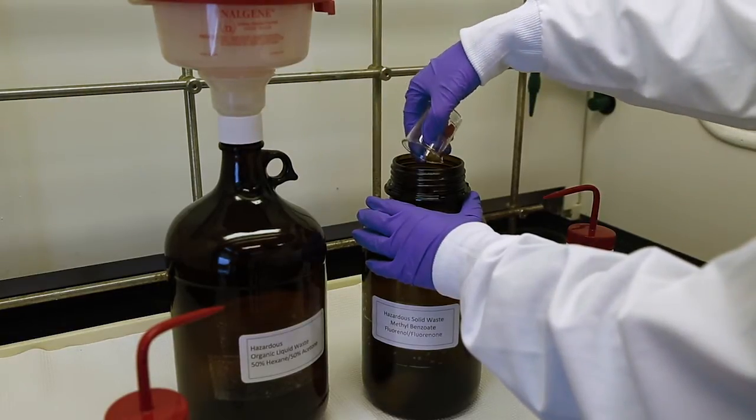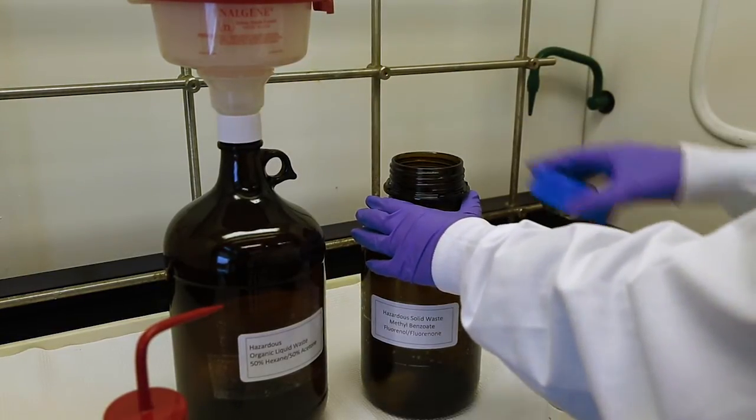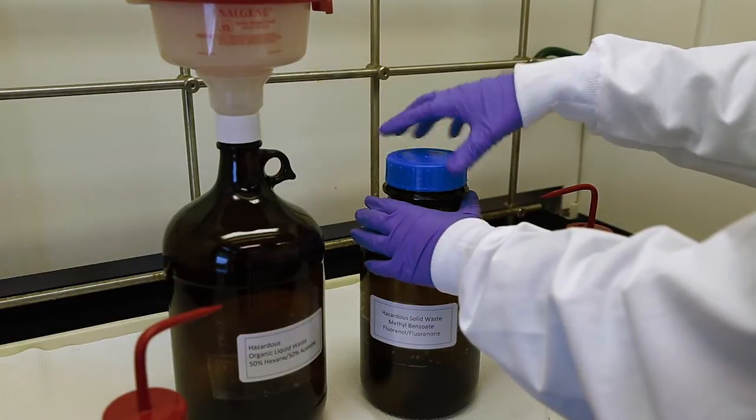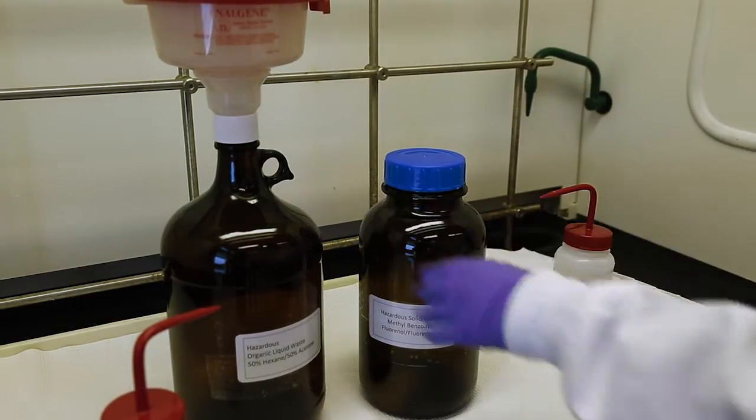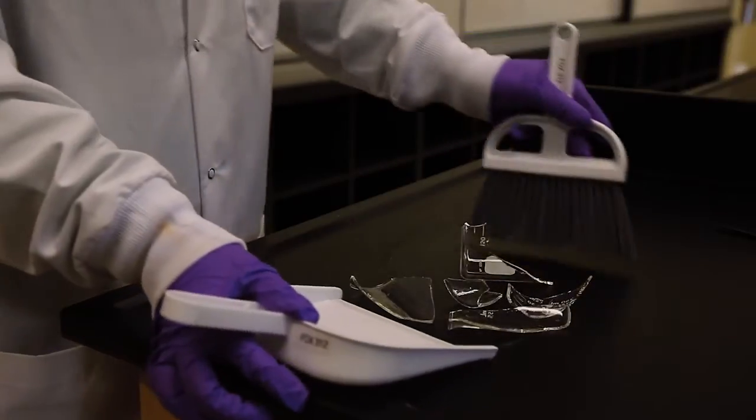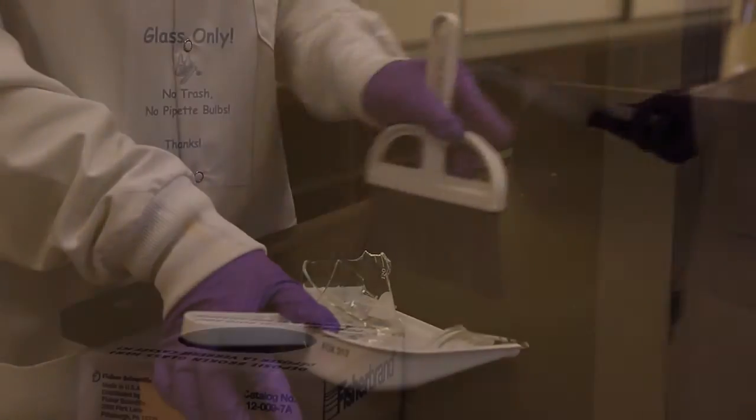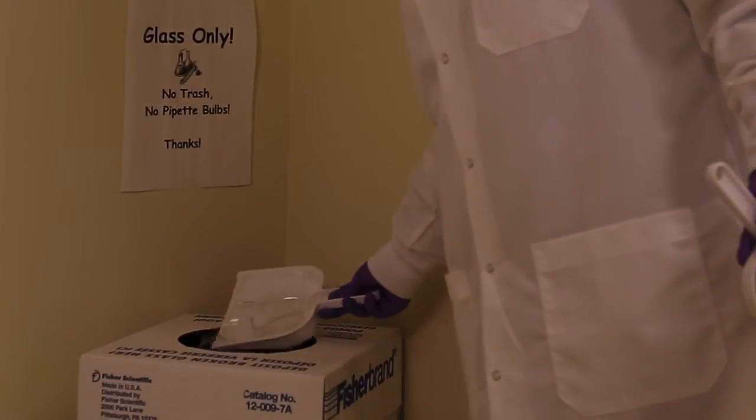This includes the products of your reactions as well as any excess reagents that were not used. If any glass was broken during the experiment, be sure to carefully discard it in the broken glass container.